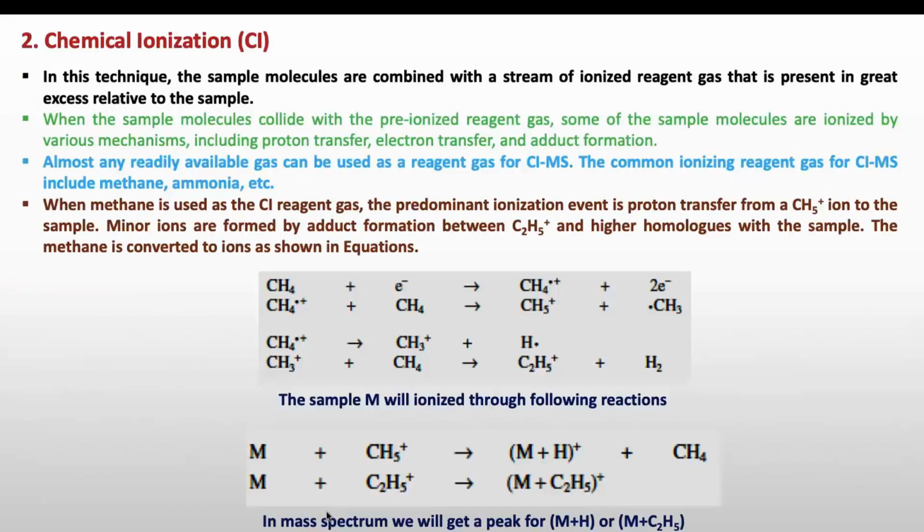Now the second method we use for the ionization of a sample is chemical ionization. In this technique, the sample molecules are combined with a stream of ionized reagent gas that is present in great excess relative to the sample. When the sample molecules collide with the pre-ionized reagent gas, some of the sample molecules are ionized by various mechanisms, such as proton transfer, electron transfer, and adduct formation. Almost any readily available gas can be used as a reagent gas for CIMS. The common reagent gases we use for chemical ionization are methane or ammonia.